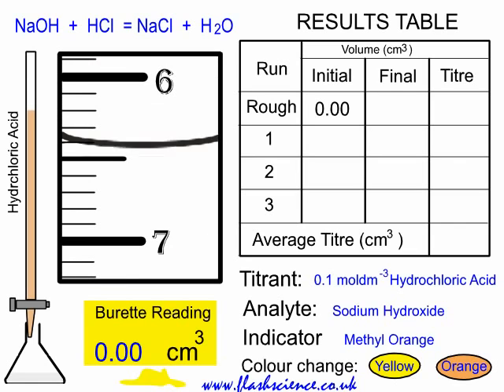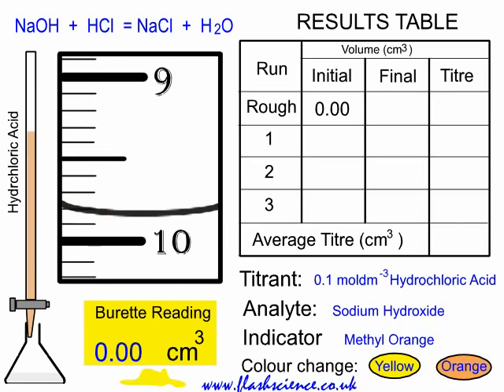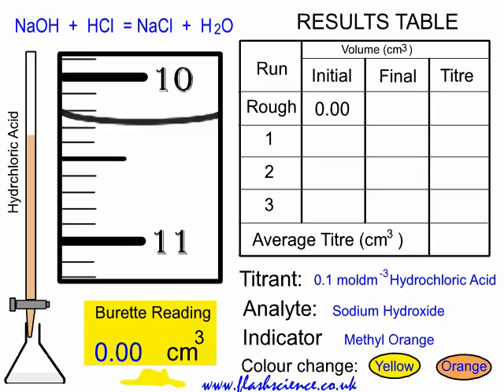This is a titration between a strong acid and a strong alkali, and most indicators will do. In this case, I'm using methyl orange. Methyl orange changes from a yellow colour in the alkali in the flask to an orange colour at the endpoint.